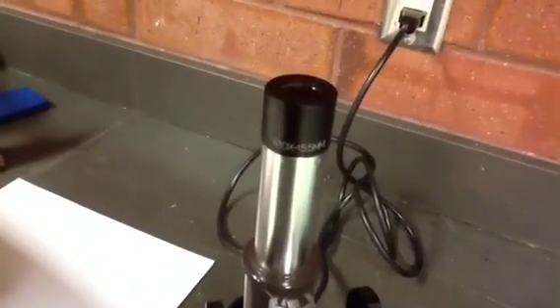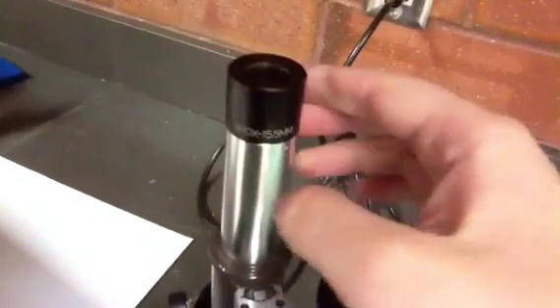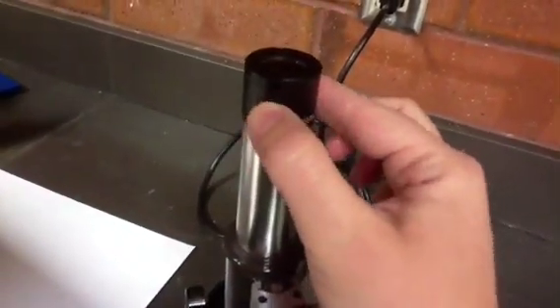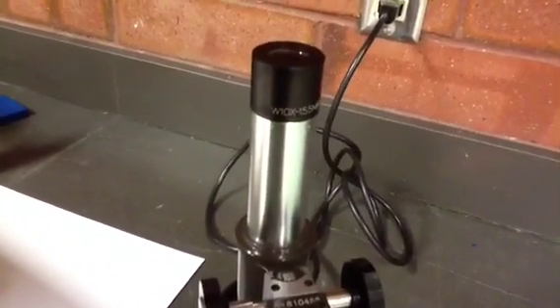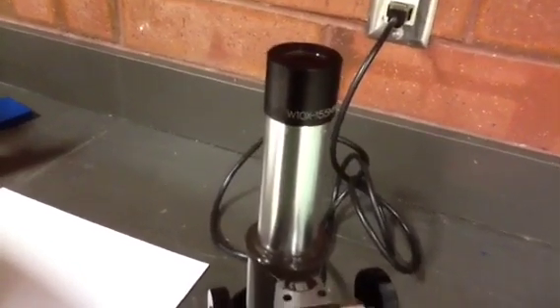Your next step will be to look in the eyepiece and finish focusing your microscope. In the top here, it rotates. When you look inside of it, you'll see a black piece. It looks like a toothpick. That's used for pointing to something if you want to show it to somebody else. You can move the pointer by rotating the top of the microscope.